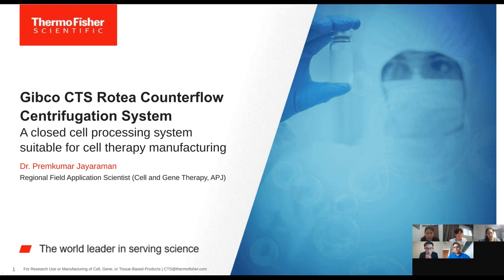Okay. So thank you very much, Ogita-san. And now we have a final question. Do you have any plans to expand the application of Rotea to target more clinical spaces? Perhaps, Prem, would you like to take this question? Okay, yeah, sure, Jack. That's a good question, but we are not going to expand it towards the clinical processing because Rotea is intended only for cell and gene therapy manufacturing, and Rotea is not an apheresis processing medical device. Meaning that you cannot use Rotea to perform an apheresis to take out a sample from the patient by connecting Rotea to the patient. Once you have used an apheresis processing machine to take out a leukopak or an apheresis product, you can again use Rotea to process those apheresis material to separate out the PBMCs and then further separate the lymphocytes and monocytes for your cell therapy manufacturing. Hope that answers your question.